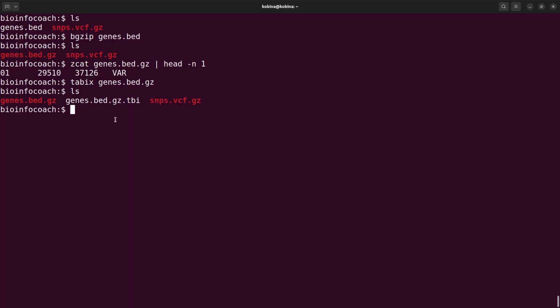Okay, now it's time to add the gene names to the VCF file here. Before we do that, it's important to check the contents of the VCF file to make sure that everything is okay. With what we are going to do, we are going to add the gene names and it will go into the info field. Now, for those who don't know the VCF format, just check online. I'll leave some links you can use to check the format of a VCF file. We will need to check the info field because that is where the gene names are going to be added. So what we are going to be doing now is this.